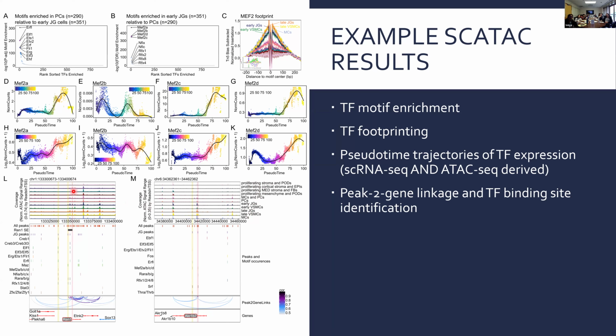And we can see that there's a peak getting more and more defined as we go, and additional peaks become available. So more regulatory regions are becoming accessible because we're trying to regulate this gene. And that's what the peak-to-gene linkages are showing. So these are all links showing how strongly correlated they are. The darker the color, closer to black, the stronger, so these regions that I have highlighted in yellow are linked to the promoter at renin. And then we looked and saw, oh, there's a motif for the MEF2 family, for the NFI family that we looked at, and some other ones that suggest, well, this is a region that we always see open in renin cells.